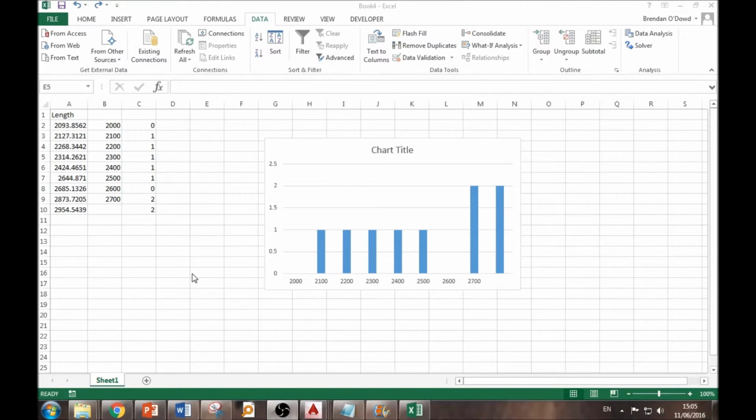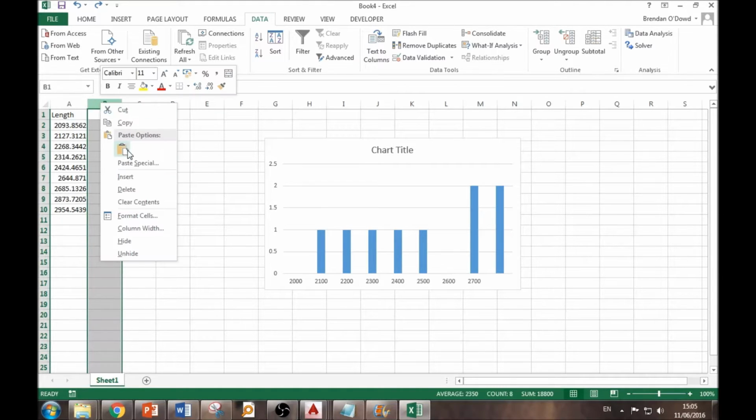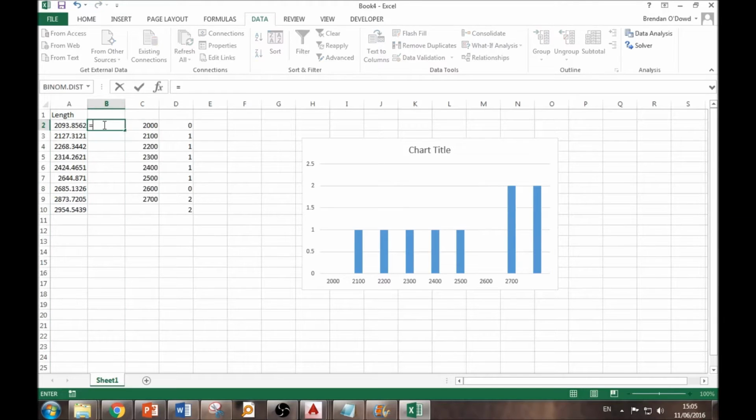Okay, just one quick edit is that my SEM image was taken at 45 degrees, so these are not the true lengths of those wires. So let me make an extra column here where I multiply each of those values by the square root of 2 to correct for that. So I'll multiply that by the first column and drag that down.